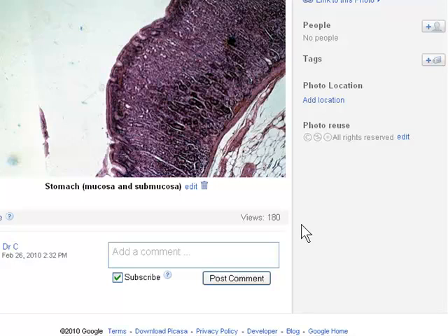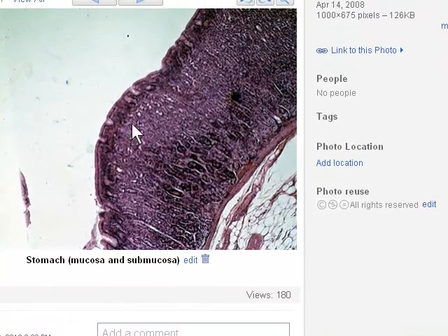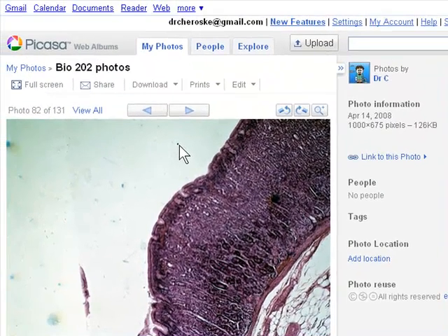So the muscularis, of course, is also called the muscularis externa. I tend to call it the tunica muscularis. And of course, the stomach has 3 layers instead of 2. It's got an oblique layer in addition to the circular and the longitudinal. Okay, we can't see those here, but the circular and the longitudinal layers of the tunica muscularis will be necessary to find in these slides too.